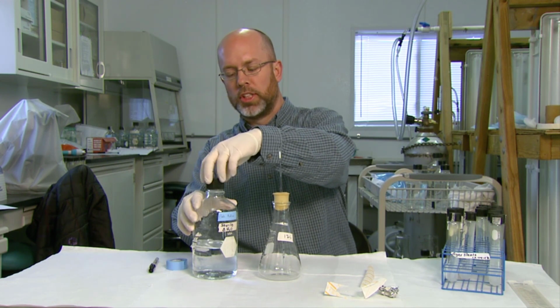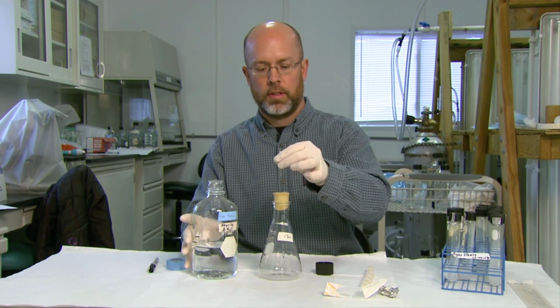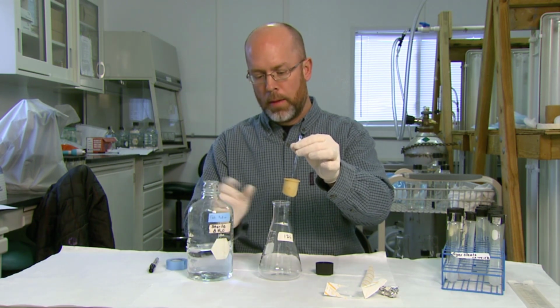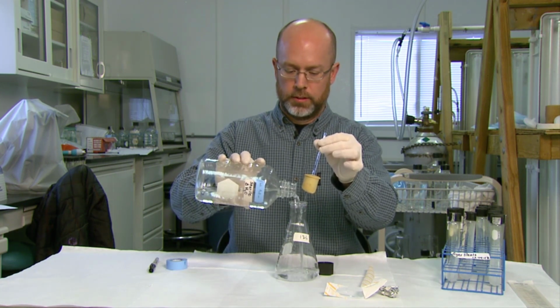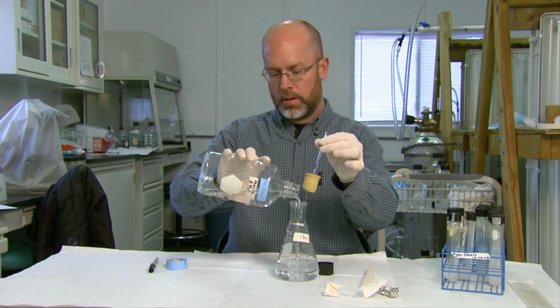So you want to go ahead and loosen the cap on your media. Take the cap off, lift the stopper out, and you want to add about 300 milliliters of media to a 500 milliliter flask. It doesn't have to be exactly 300.